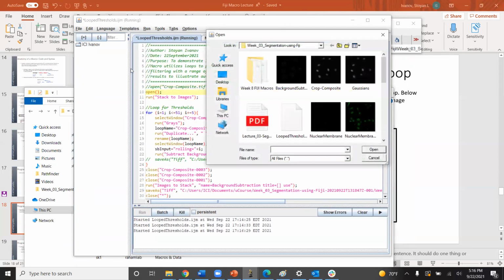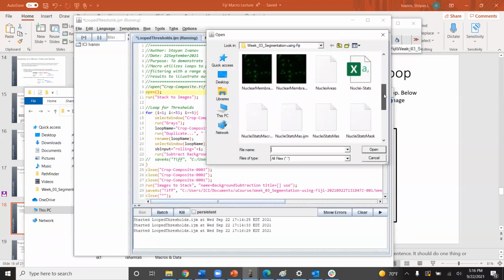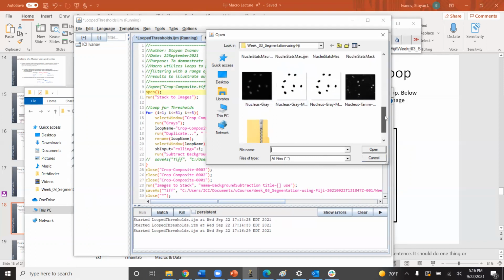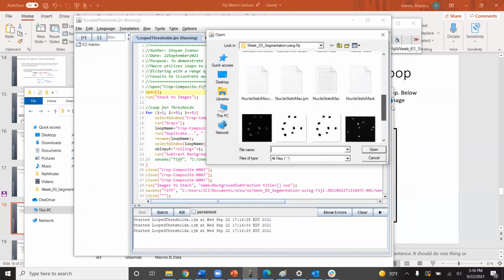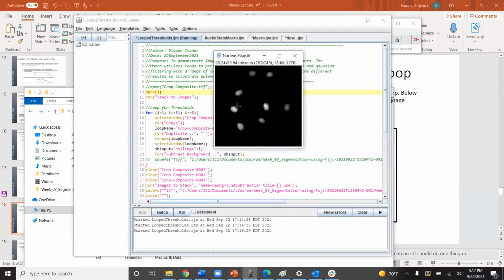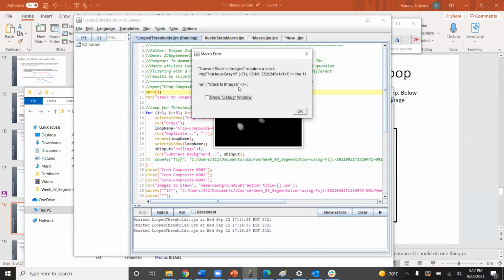If you run open without any input arguments, it will open up the interface and allow you to select. This does make it a bit more interactive. So if you're processing large amounts of data, you wouldn't want to do this. But as Gaurav mentioned, it is useful in cases like this. That's very helpful. Thanks, John. Yeah, you open that here, click open. There it is, and then it goes on.